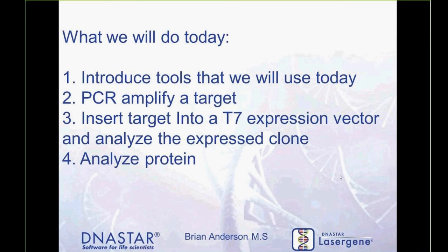Thank you, Jackie. Hello, everyone. As Jackie mentioned, my name is Brian Anderson. I am one of the technical sales scientists here at DNASTAR. I've been with DNASTAR for just under 8 years. Before coming to DNASTAR, I did have the opportunity to work at a company whose primary products were utilized for protein expression and purification. So I do have some background knowledge and experience on the topic that we'll be discussing today.